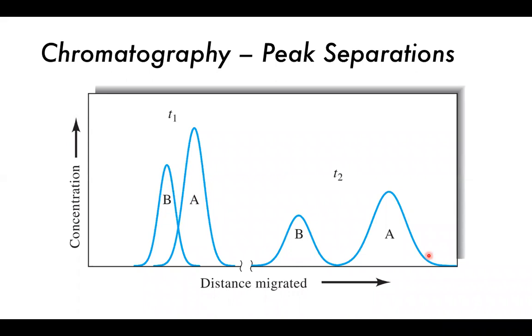One of the important things in chromatography and in the choice of how we do this is that it's not just a case of any organic solvent will do and any silica will do. We need to make sure that our A and B, our reactants and our products, are well enough separated that we can either measure their quantities, or separate them well enough that we can move on to the next step in our chemical reactions or even just get a pure product.